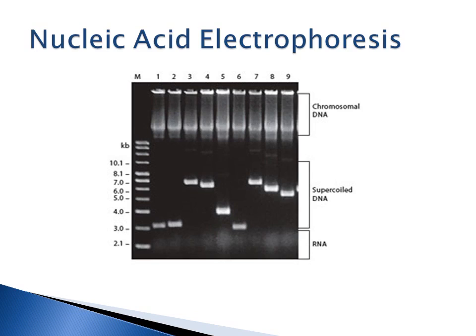So if you just did a nucleic acid extraction, a phenol chloroform, you're going to get DNA and RNA and possibly any plasmids that are in there. In order to separate your DNA or your RNA, usually if you wanted DNA, you're going to use RNase to remove the RNA. If you wanted RNA, you're going to use DNase. If you want just plasmids, you do what's called a plasmid prep, which is one of those extraction kits specifically for plasmids, so that you don't get the genomic DNA, you only get the plasmid DNA.